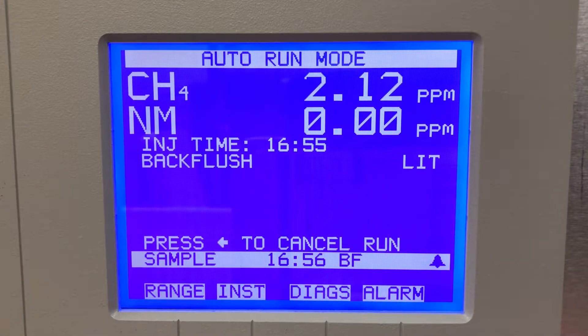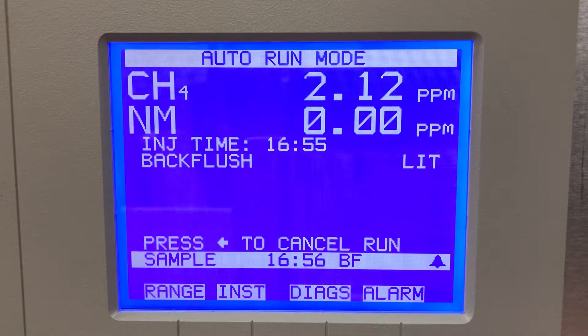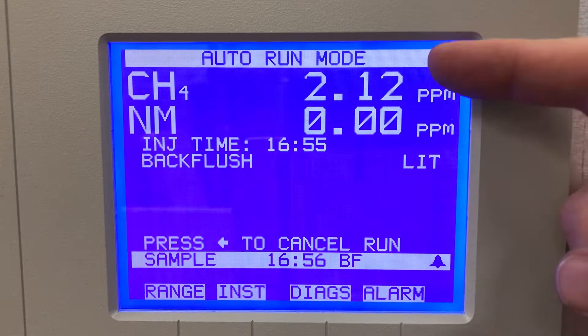Hi everyone, Jim with CDNova again. Today I'm looking at the model 55i methane/non-methane analyzer display menu. I'll go through a bit of the display menu functions on this unit. This is a two-channel gas chromatograph for measuring methane and non-methane.